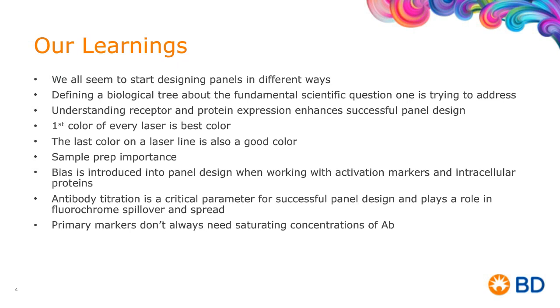But other things that have come over time and learnings have a lot to do with how we introduce bias into a panel. And that can be from several perspectives. Number one, it could be we might be looking at intracellular proteins.